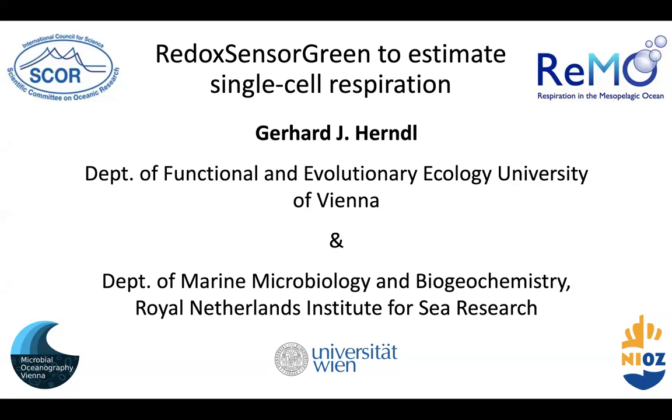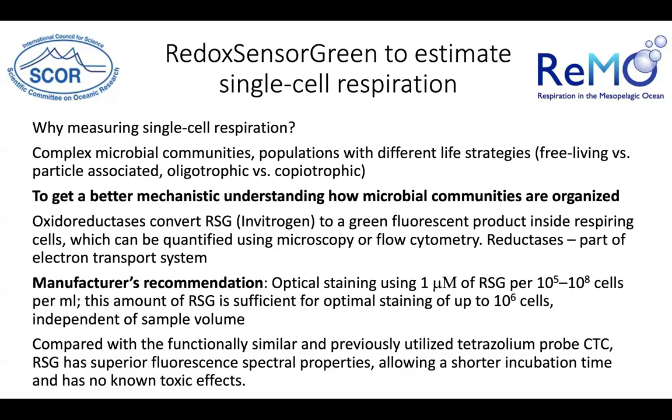Okay, I will talk about using the RedoxSensorGreen to estimate single cell respiration. I'm at the Department of Functional and Evolutionary Ecology at the University of Vienna and have a joint appointment with the NIOZ in the Netherlands. In contrast to what Morten said, I will not talk about pressure effects because we don't have really measurements on the role of pressure on respiration. We have done some laboratory experiments, but this is really too premature to present.